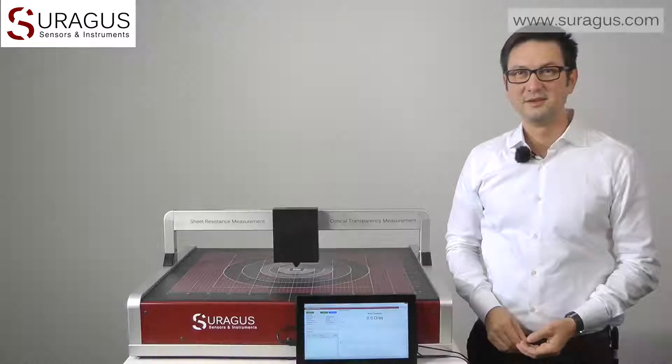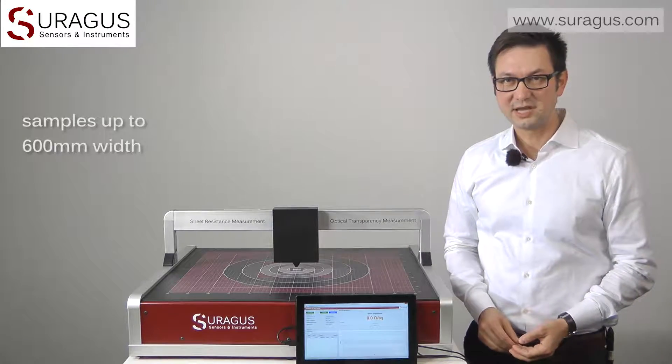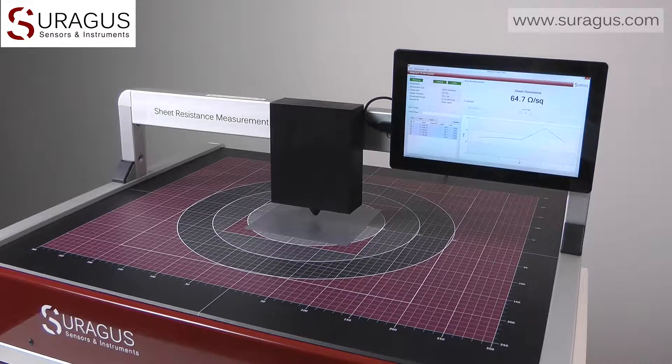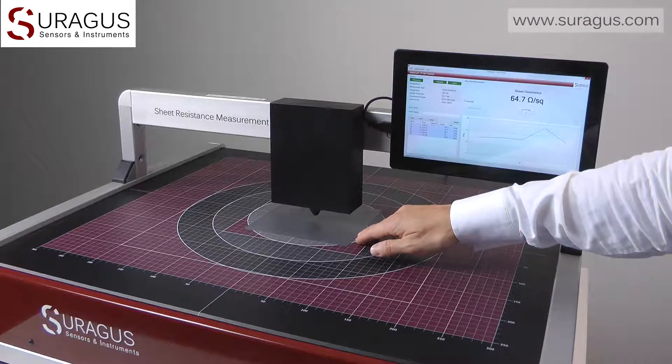Welcome. My name is Martin Busch and today I am going to introduce our largest single point measurement device, the Eticus TFLAB 4040. This device is able to measure large samples up to 600 mm width. No touching or contacting of the sample surface is needed, since the device applies a weak electromagnetic field between the upper sensor and the measurement field.